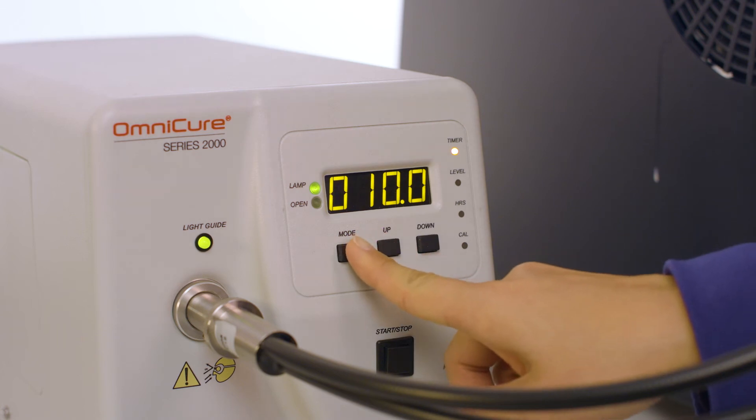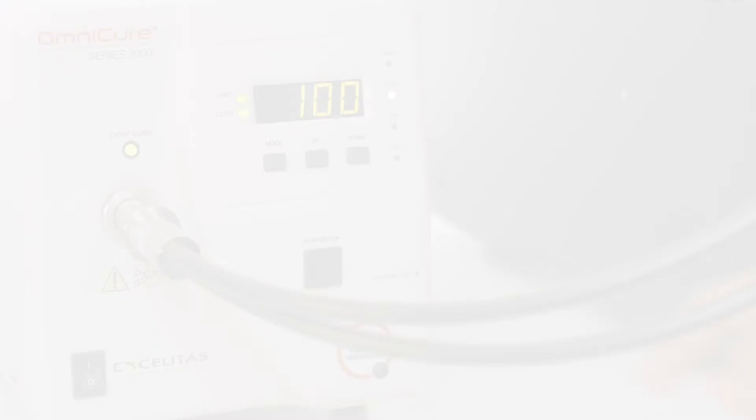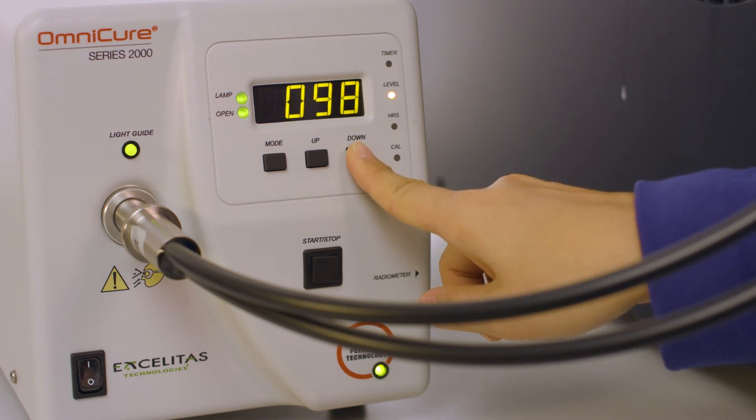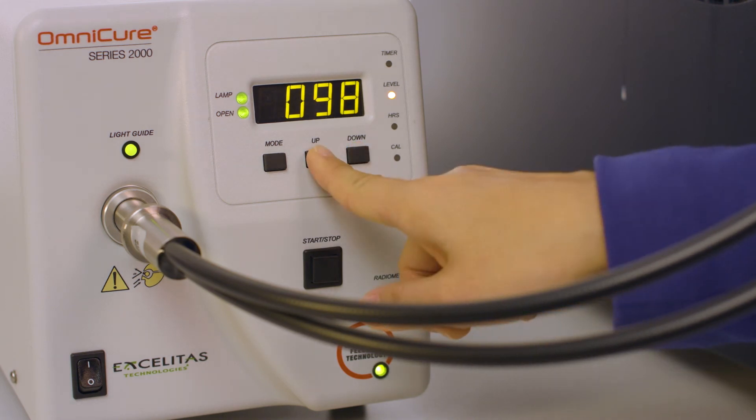In the light source, press the mode button until the level option is active. Use the up-down adjustment button to adjust the intensity reading at the sample and reference position until the desired intensity is reached.